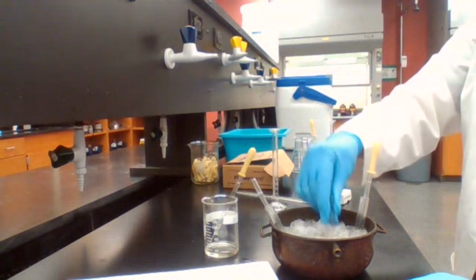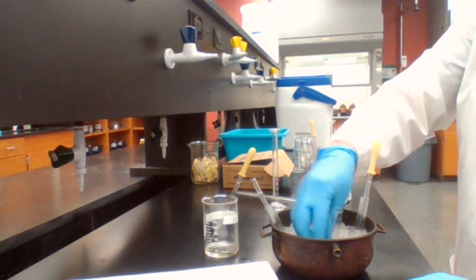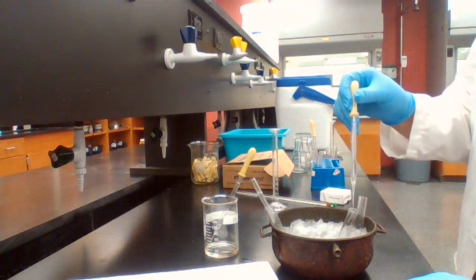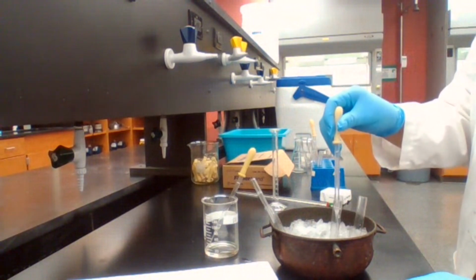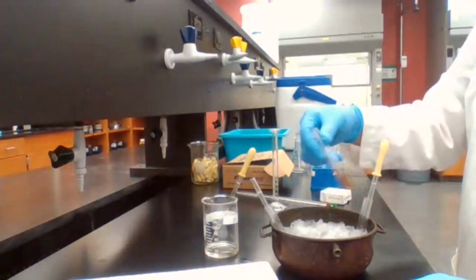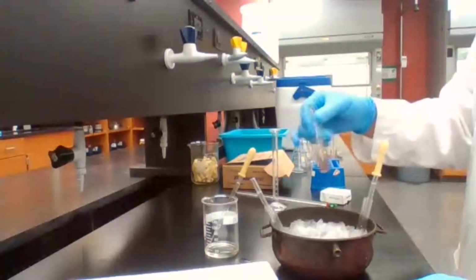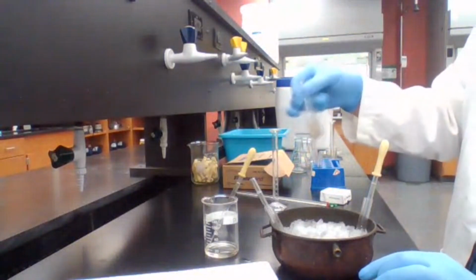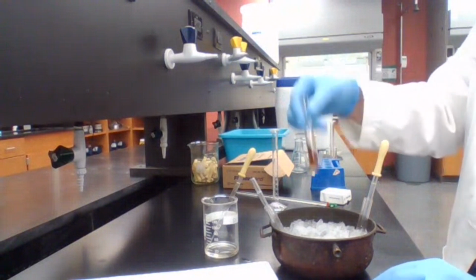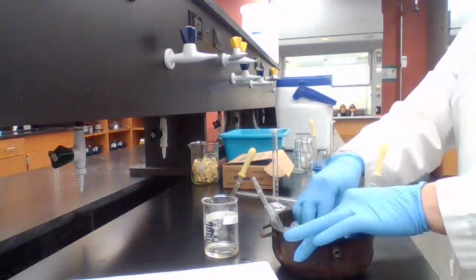One of the chemicals is contaminated. I cannot figure out which one. I hope we could still get the product, and maybe with some byproducts. But the color is not even the color of the dinitro product. It's a new color.